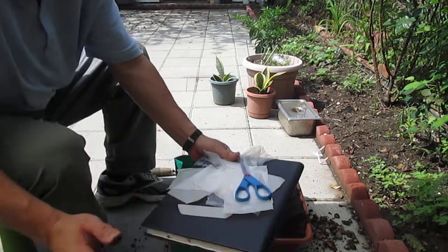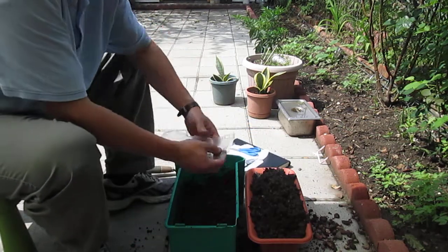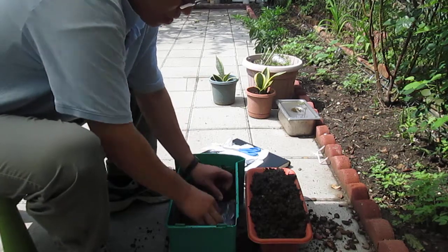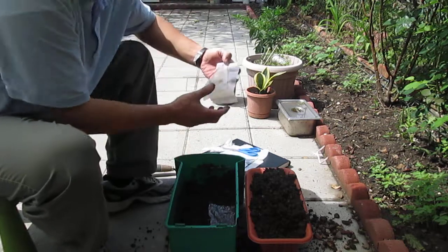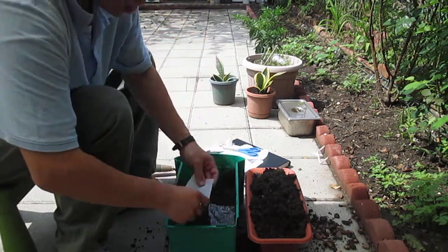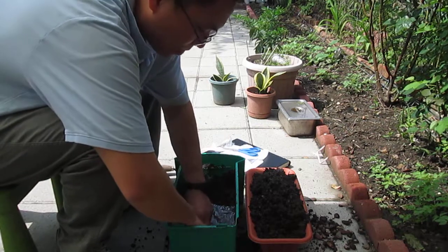I have prepared some films: mulch film, buried film — different ones. This one is for diaper application. This one is from a biodegradable shopping bag.